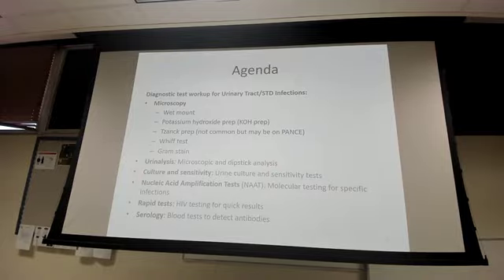This is our agenda. So we're going to go over our microscopy, our provider-performed microscopies. Y'all remember what wet mounts were, right? What are they?